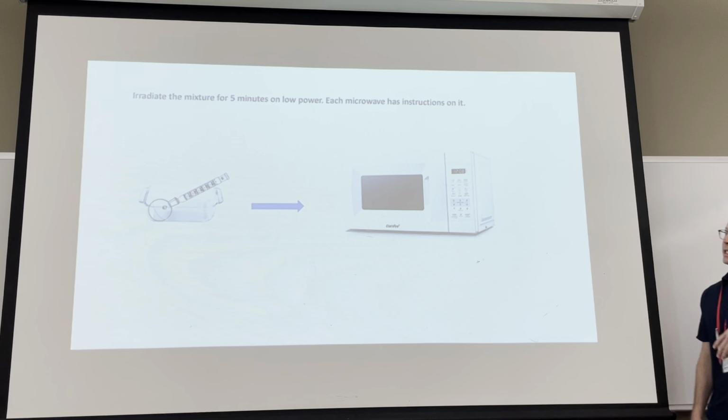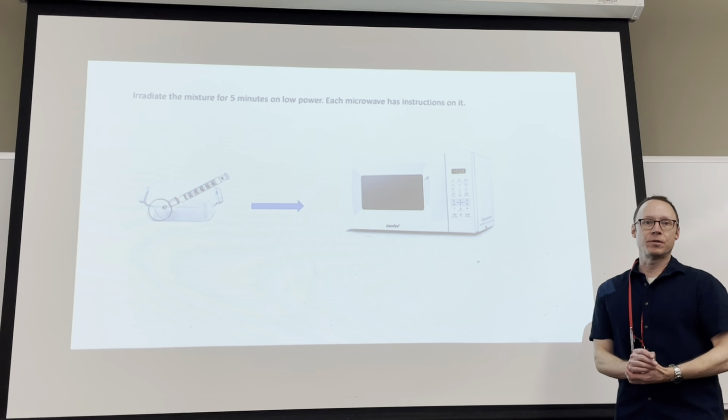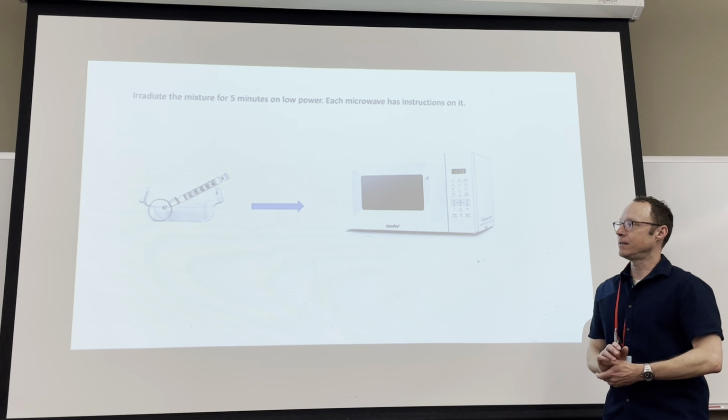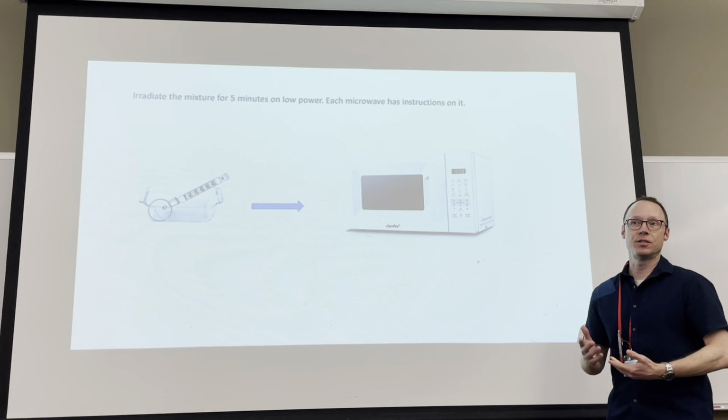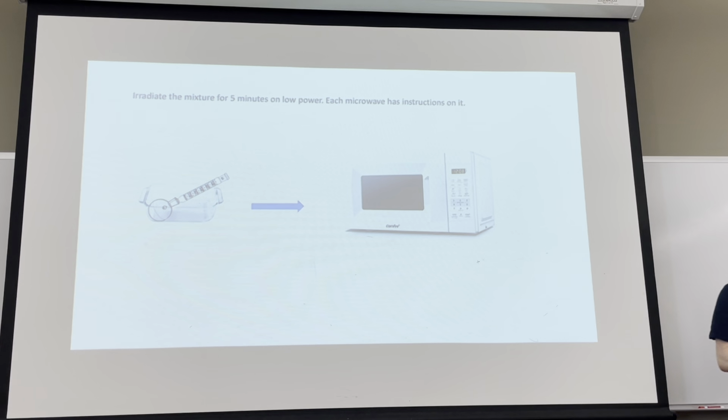What you're going to do is you're going to get your apparatus set up. And like I said, we've got 2 microwaves working. Let's see if I can find a third one, but we'll have at least 2. So you're going to have to put your name on the board, because obviously with 2 microwaves, you might have to wait a few minutes. But it is only 5 minutes per run. So with 2 and with 12 people, it shouldn't take that long.